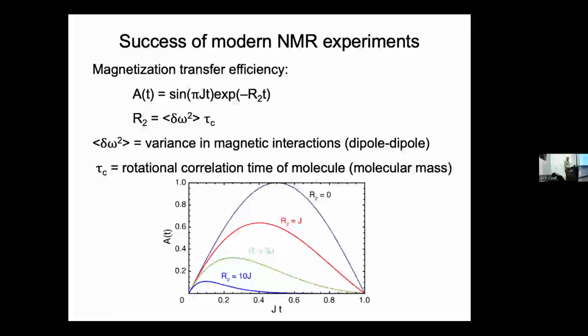Immobilize the protein. Immobilizing makes it go even slower. Right. And you can switch to solid state NMR, of course, but then you have to spin really fast by MAS to replace the fact that there's no tumbling. Right? Somehow you have to make the molecule tumble faster. So what are your options? Probably using phase separation, like the boundary between two phases of the nucleus.